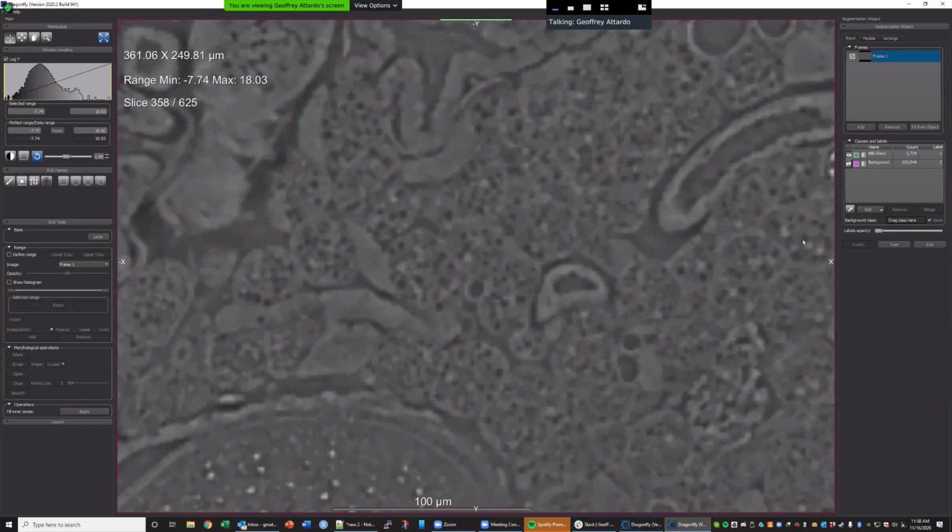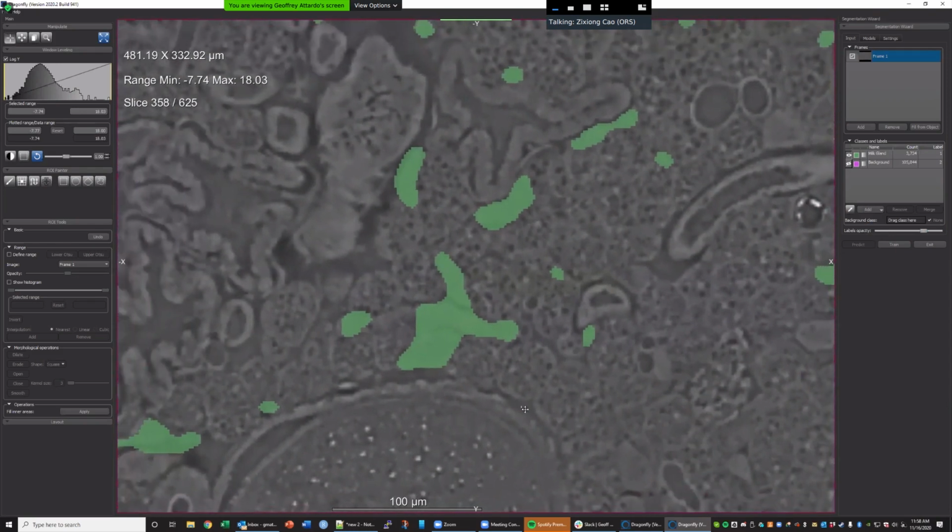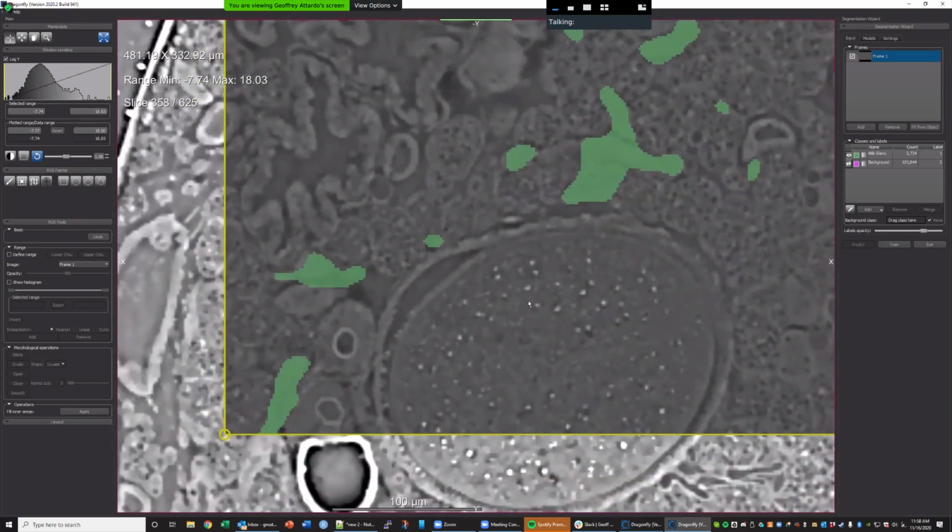I think that's kind of a sloppiness on my part. It could probably be adjusted to eliminate the space between those tubes. Yeah, in that case, if you want a more accurate model, you probably need to correct this. But you don't have to do it now. Even without correction, we should be able to get something. Not perfect, but it should be working.